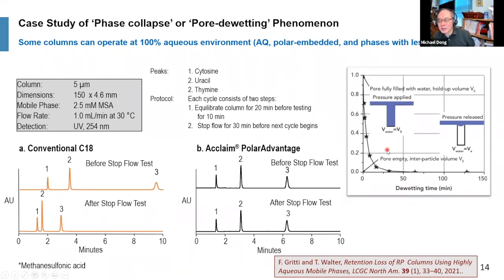So most of the C18 is inside the pores, right? So when you use a lot of highly concentrated acetonitrile, all the pores get wetted, right? Now, water has a very high surface tension, right? You know, when you have a drop of water, it comes together as a bead, right? Because of the high surface tension.